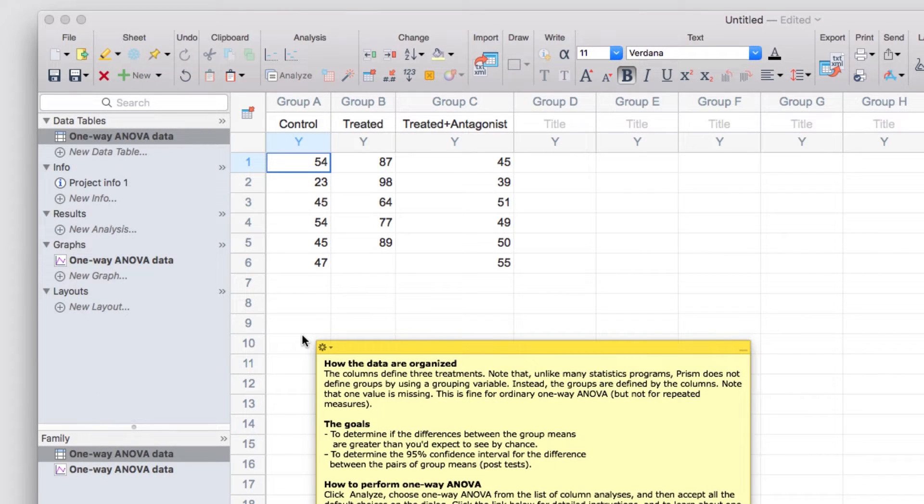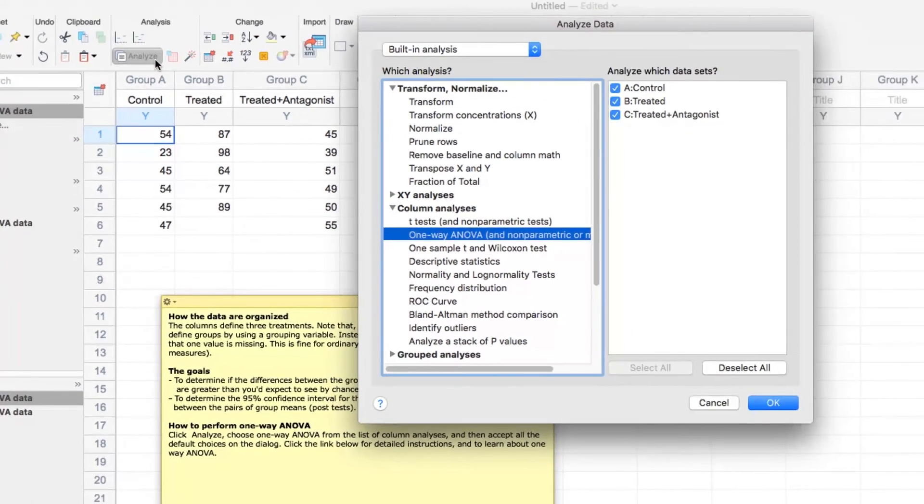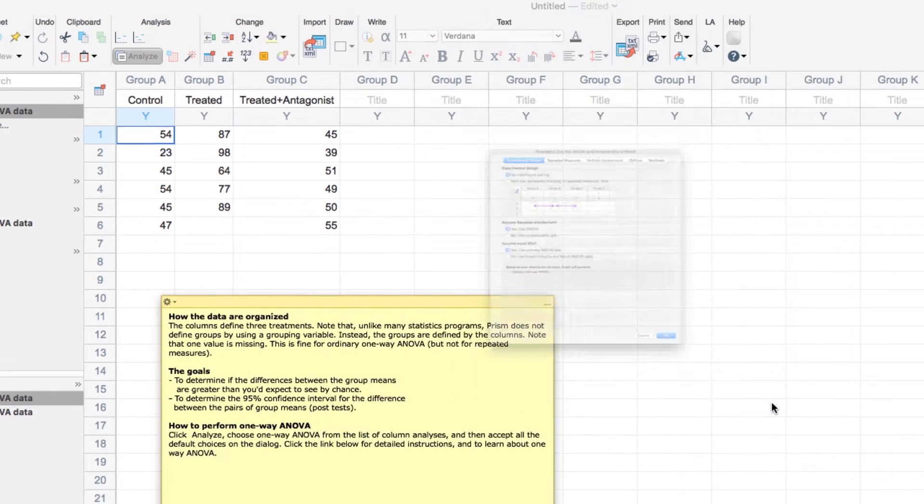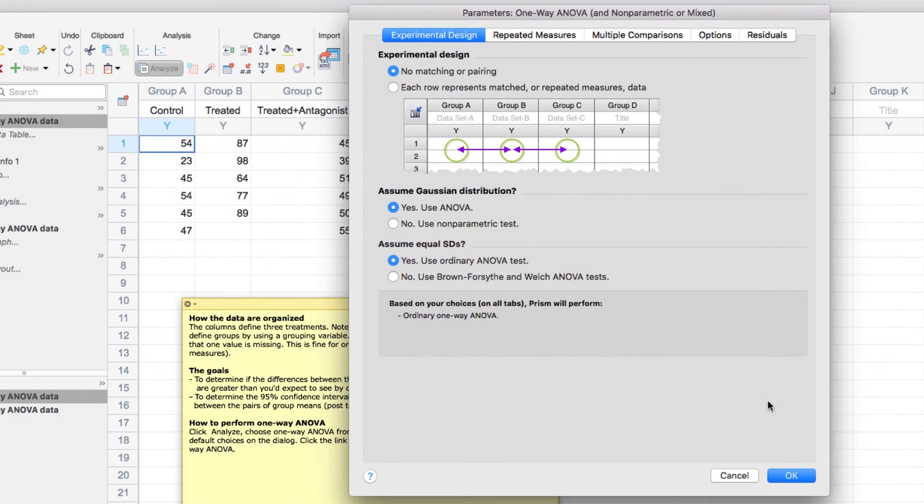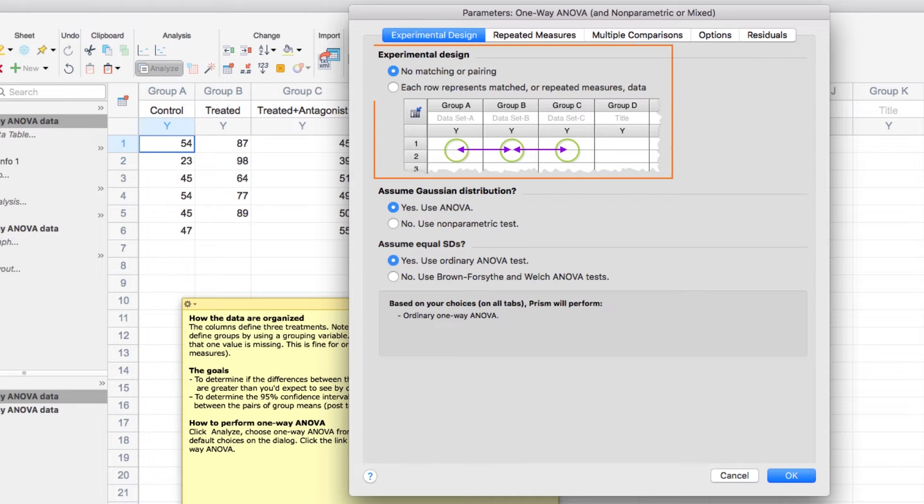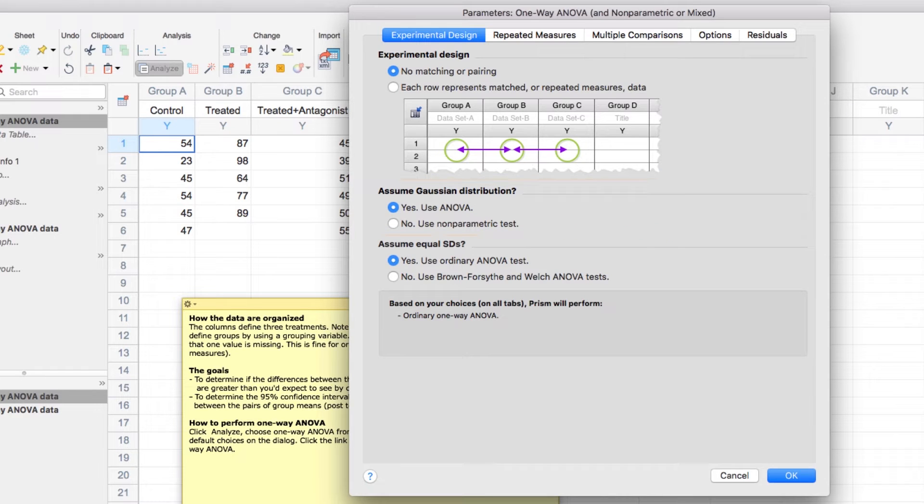Let's now look at how to perform an analysis. In the toolbar, let's click the Analyze button, select One Way ANOVA, and click OK. In the dialog that appears under the very first tab of Experimental Design, you'll be able to make any necessary changes to the analysis based on your own experiment. For example, whether your data were matched or paired, or whether you can assume that your data were sampled from a Gaussian distribution.